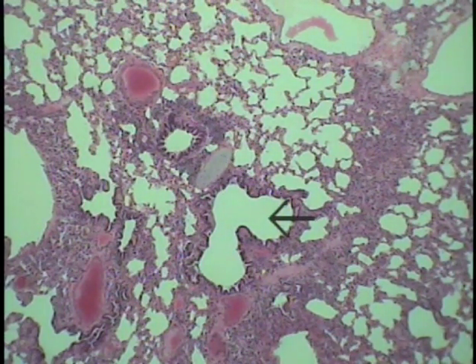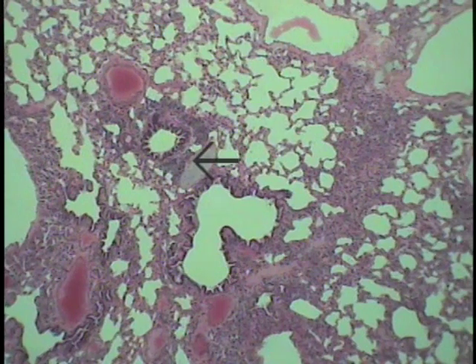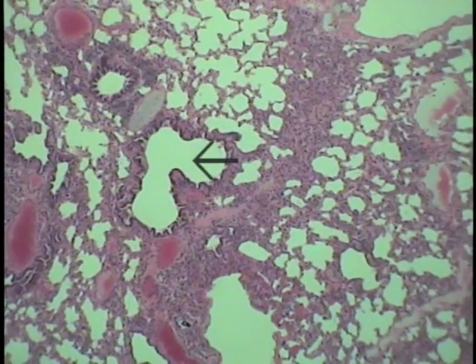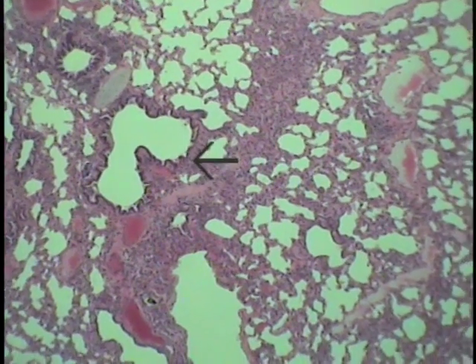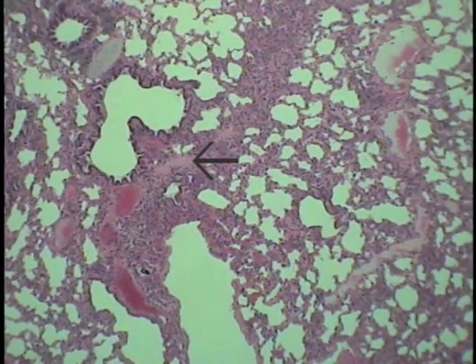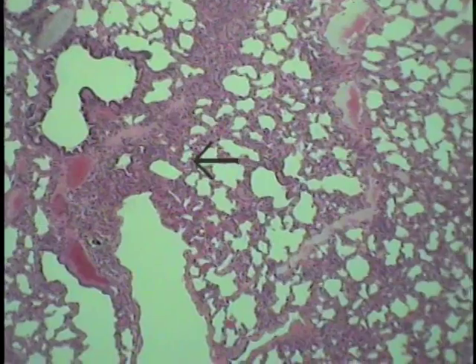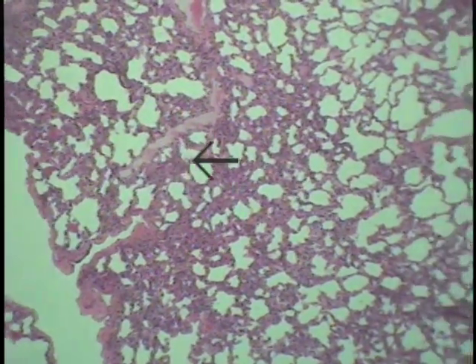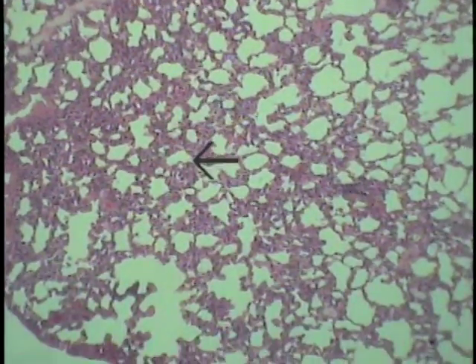And what will happen as this transitions now into a true bronchiole is that the cartilages will disappear, the glands will disappear, lymphoid tissue will disappear, and one will be visualizing a tube that shows that folded, scalloped interior surface, and the primary element of the supporting wall is going to be the bronchial smooth muscle.